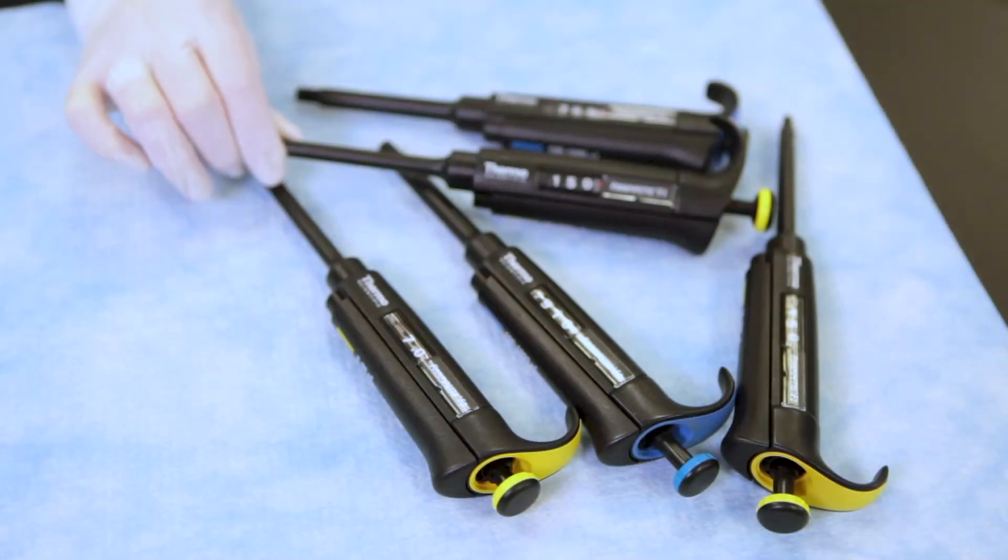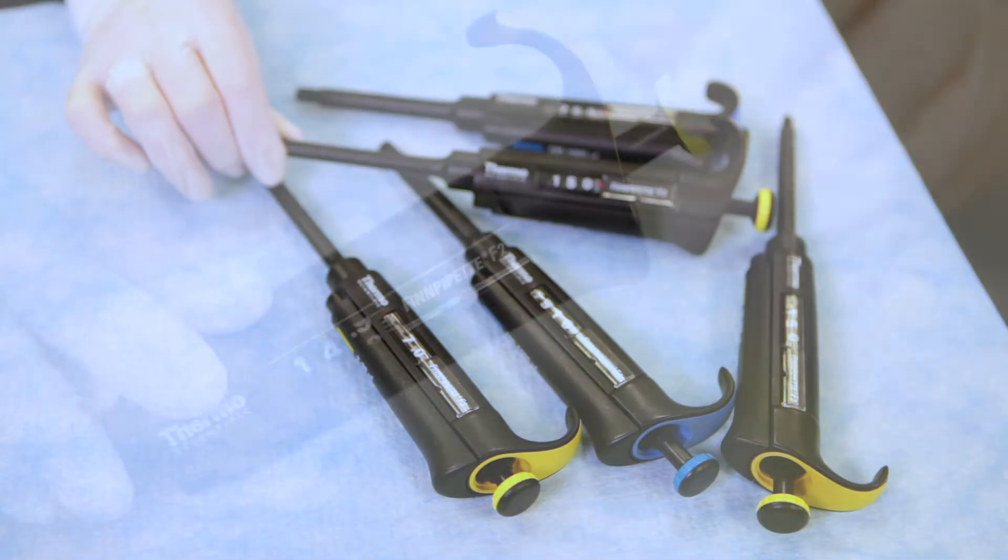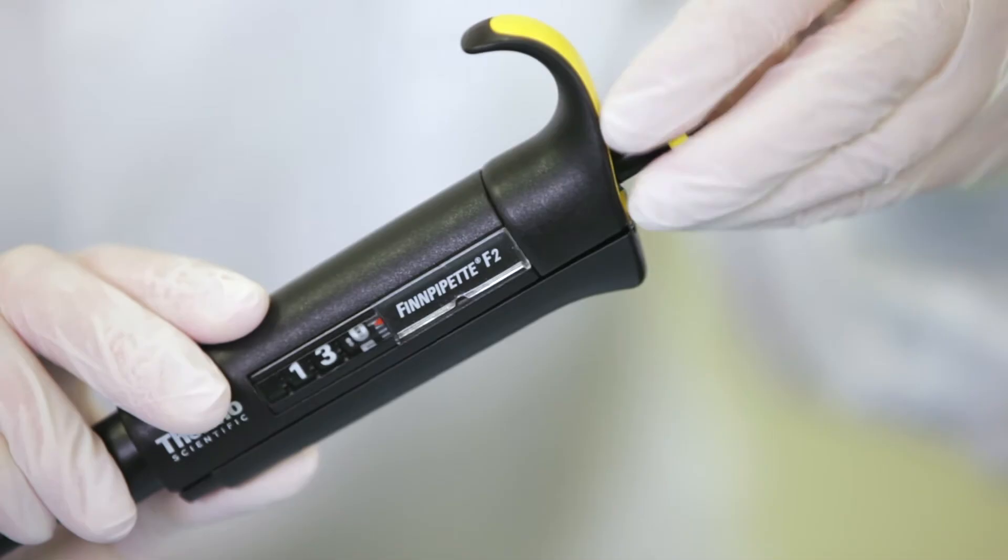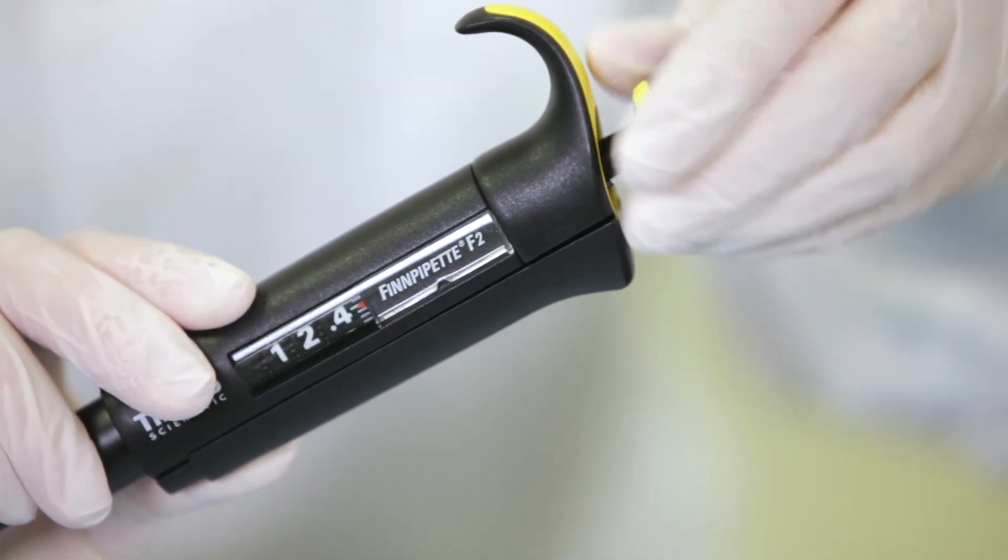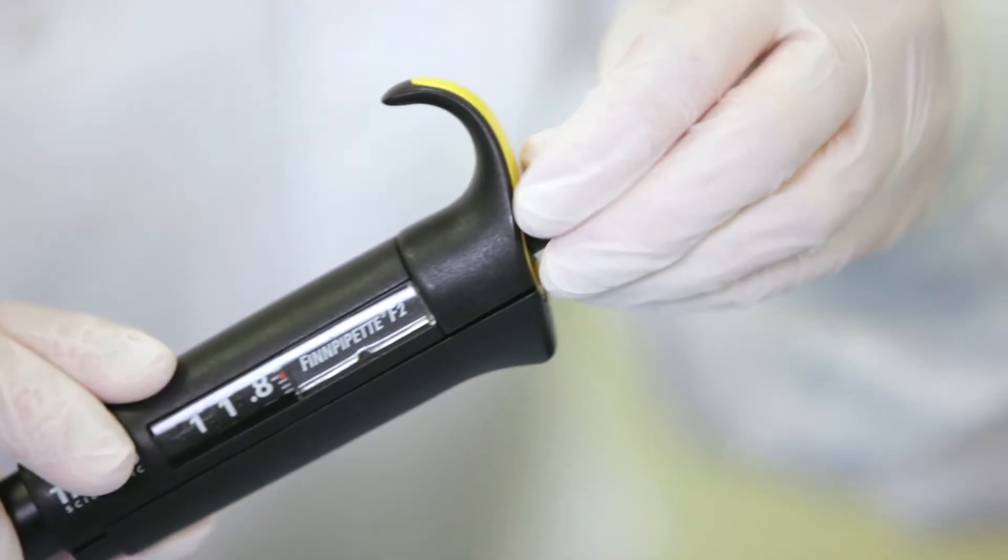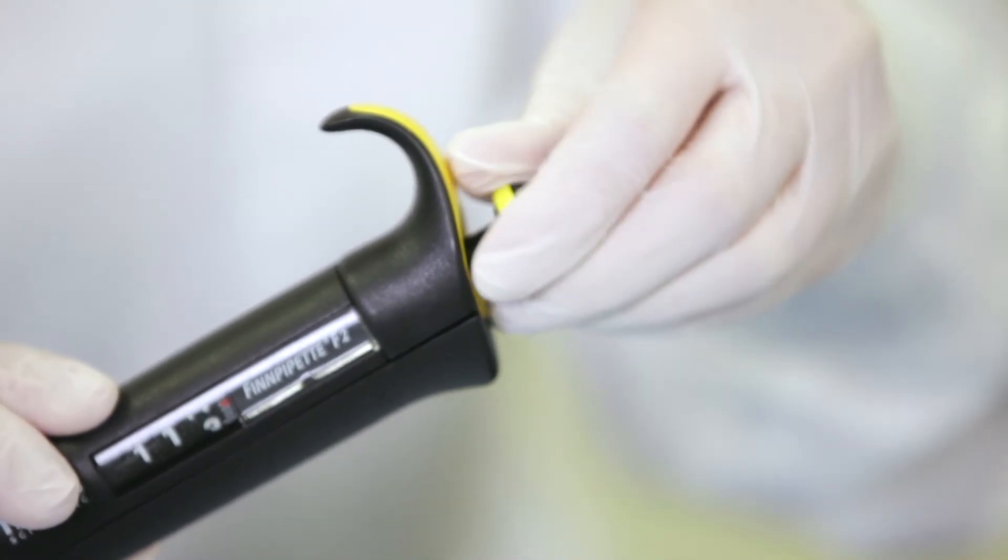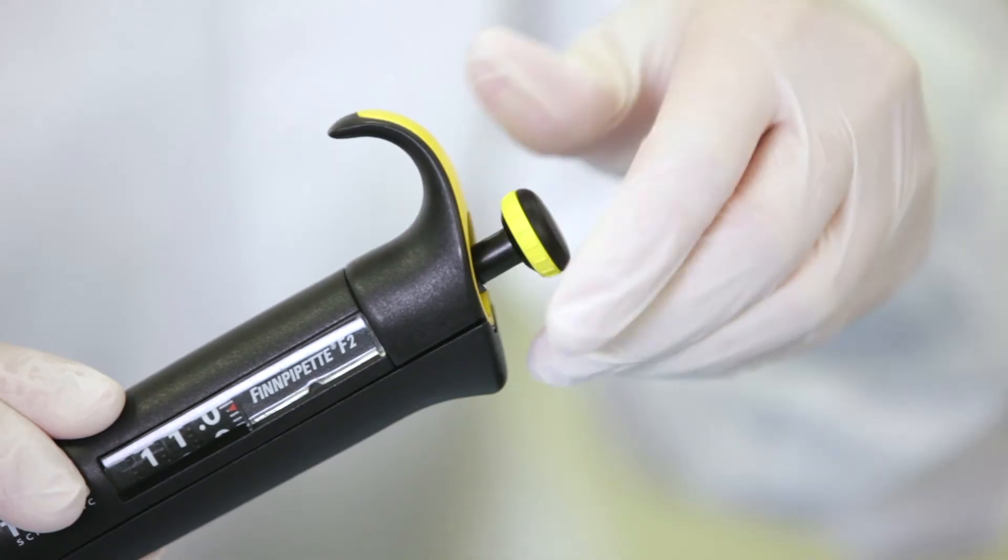Pipettes are used along with plastic disposable pipette tips to measure or transfer small amounts of liquid, usually from 0.2 microliters to 1,000 microliters or 1 milliliter. The range of volume an individual pipette measures is typically printed on the handle. The volume of the pipette can be adjusted by rotating the volume adjust knob to the desired volume.